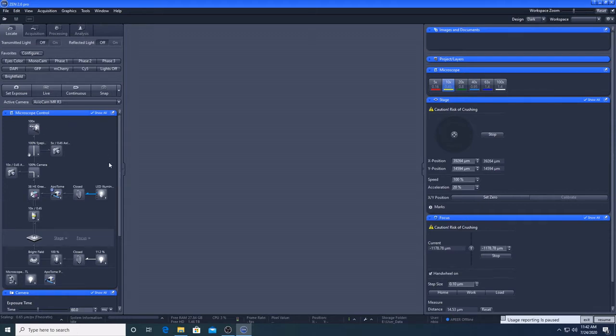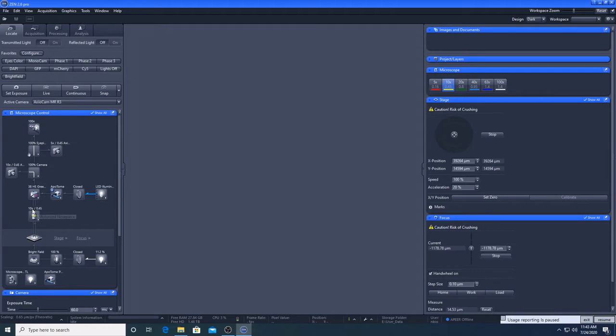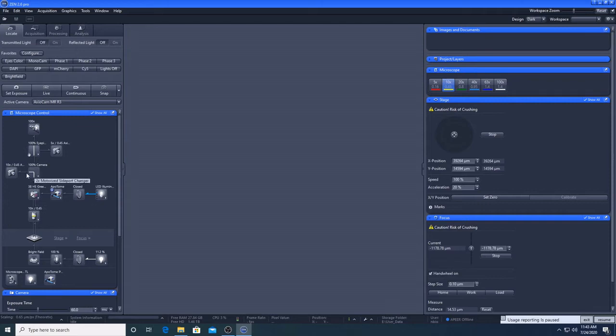Fluorescence imaging on this microscope uses one of these LEDs as a reflective light source. The light passes through the open shutter to a filter cube. The first filter allows specific wavelengths of light to pass through which then bounce off a dichroic mirror through the lens and to the sample. The light then excites the fluorophores, slows down and is reflected back up through the lens at a longer wavelength. The longer wavelength passes through the dichroic mirror and through a second filter before going to the monochrome camera or the Oculus.